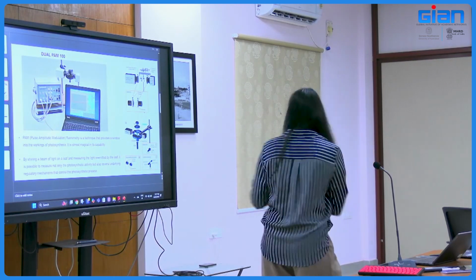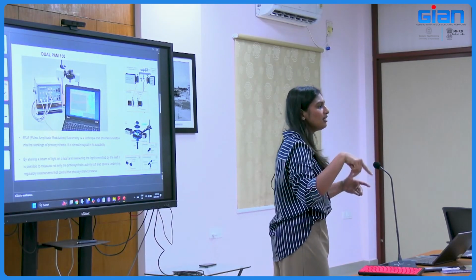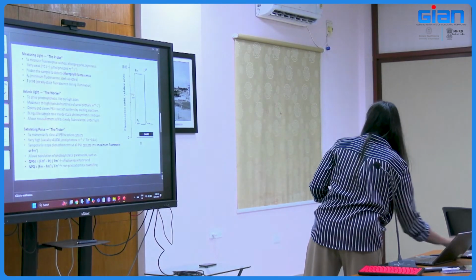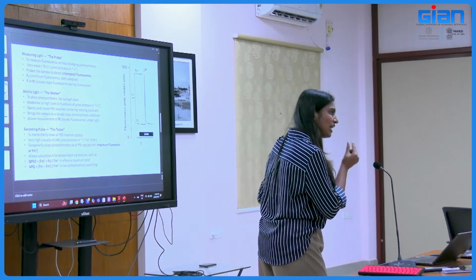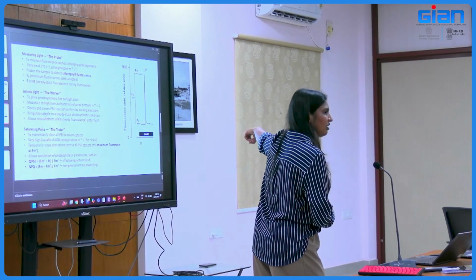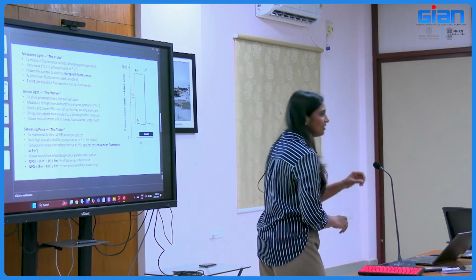There is always a fixed frequency of measuring light. The change in this frequency will be detected and amplified as the fluorescence signal. So you come here, F0, measuring light is going on. Whatever graph you got, the very high peak, is the change in the measuring light fluorescence frequency. That is why it is called PAM, pulse amplitude modulated. It never detects the other.